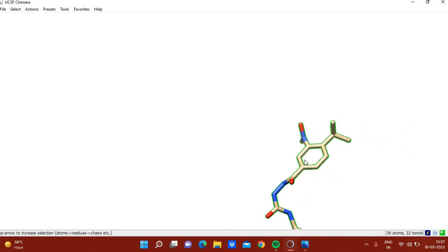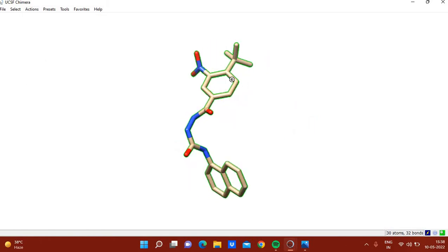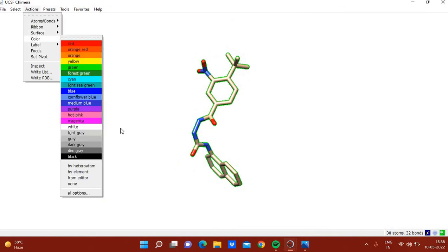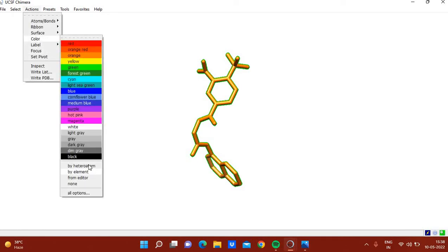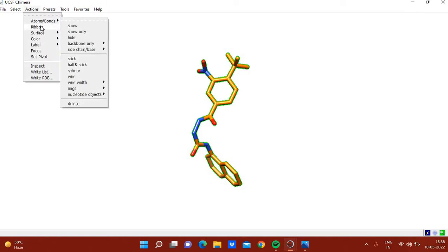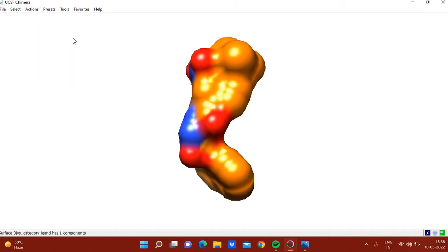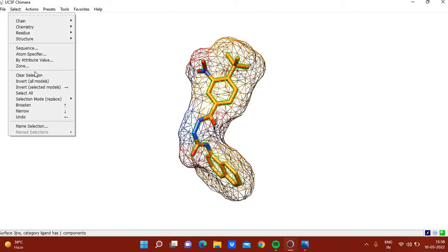You can zoom in or zoom out, and click Focus to bring the ligand to center. You can change the color of this ligand inhibitor to orange, then color by atom. You can also create a nice surface representation using the mesh option under the surface menu.